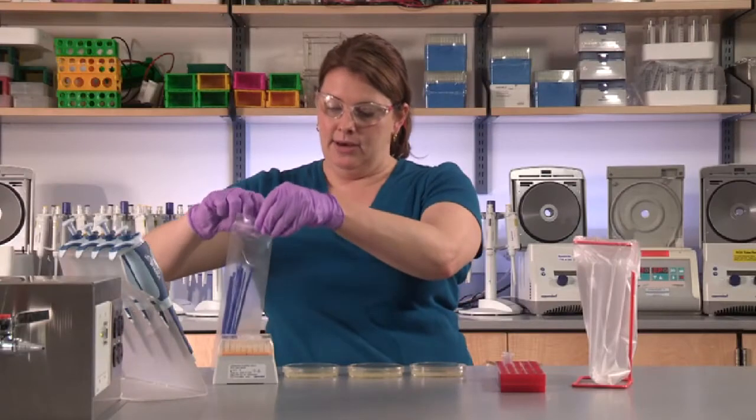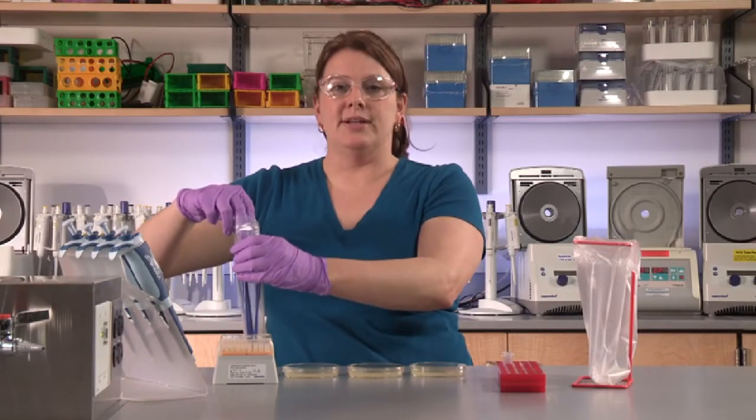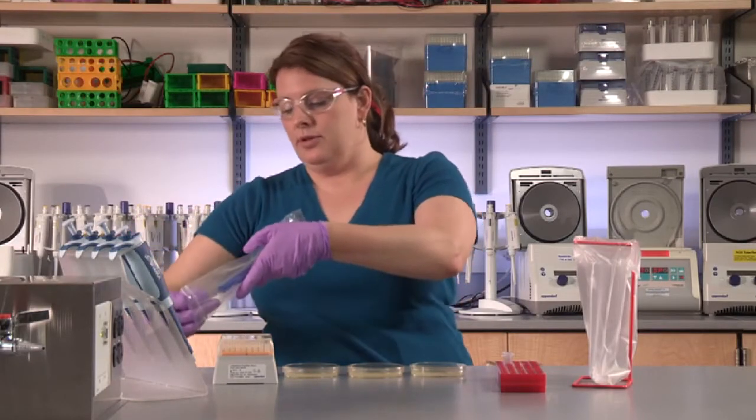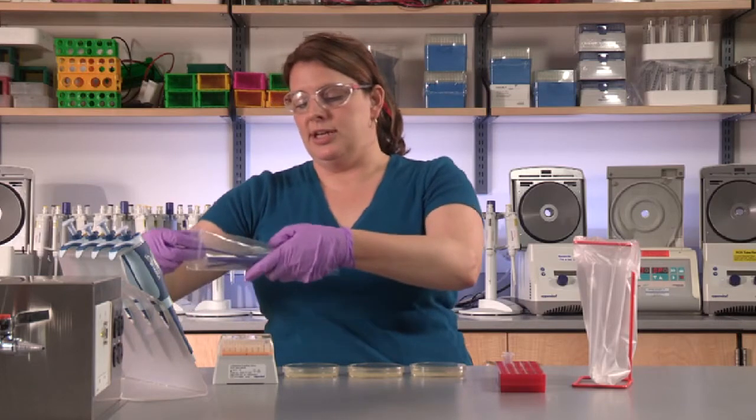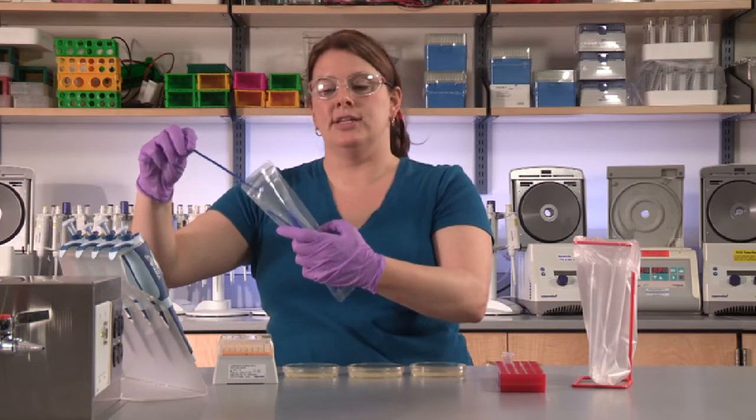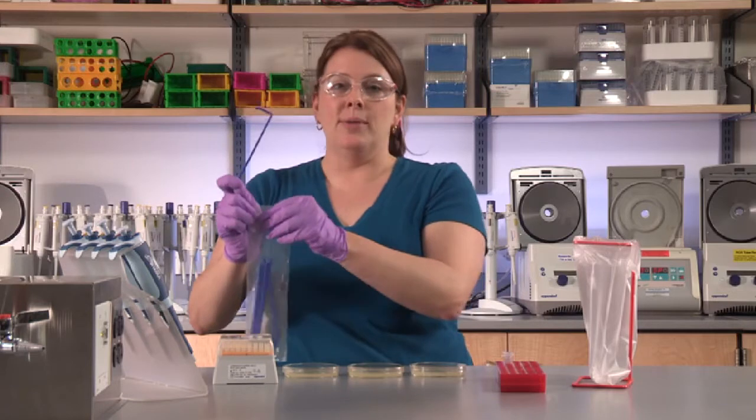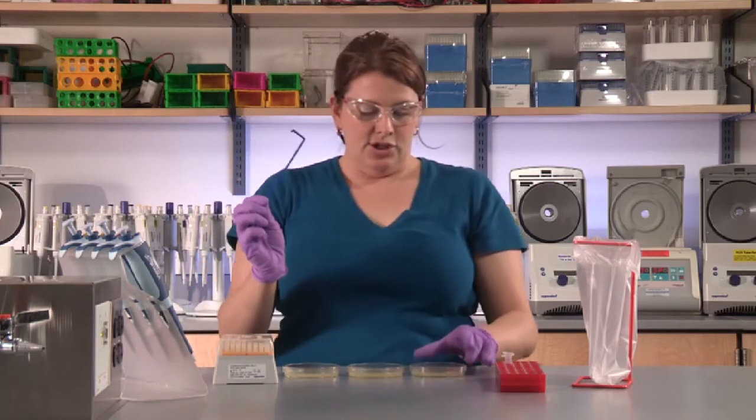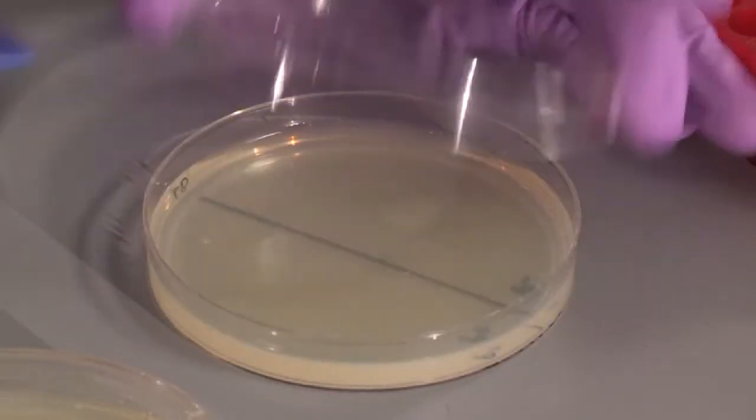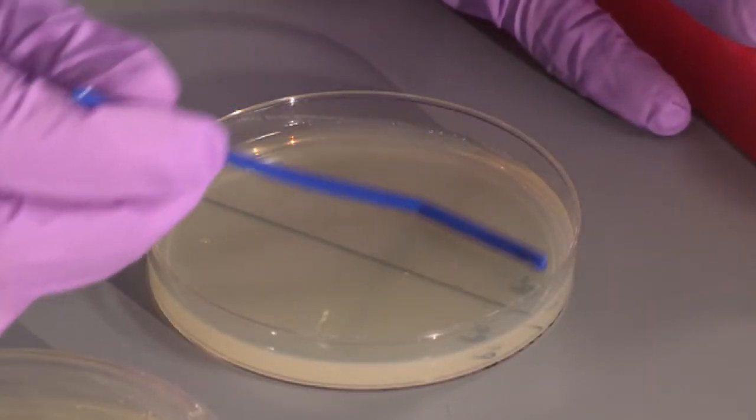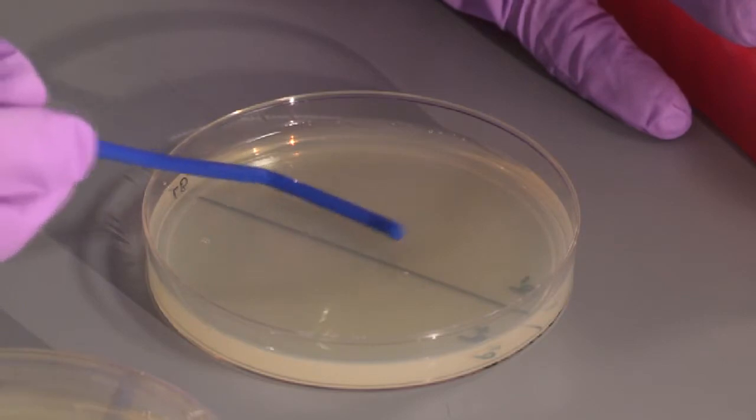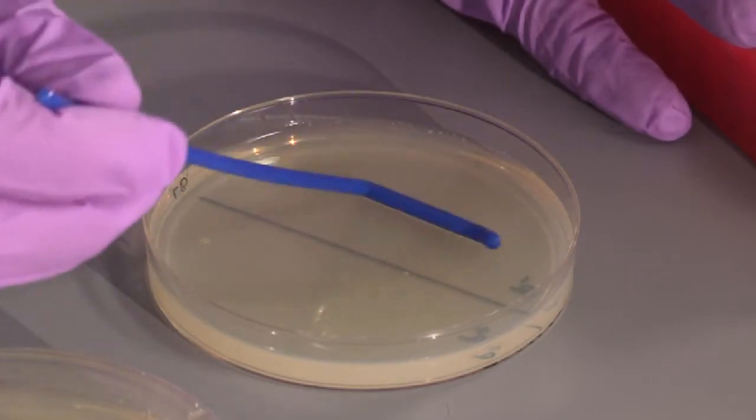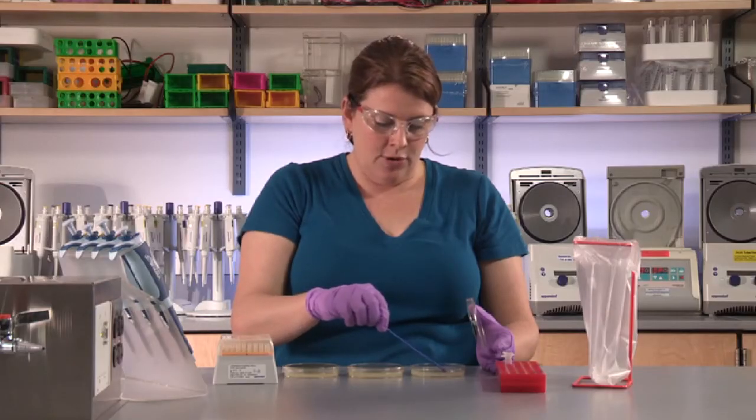Open up a packet that contains the bacterial cell spreaders. Use your fingertips to only touch the ends so as not to contaminate them. Do not place them down on the bench top as that would introduce contamination. Gently open the lids of the plates and very carefully spread the liquid using a gentle back-and-forth motion.